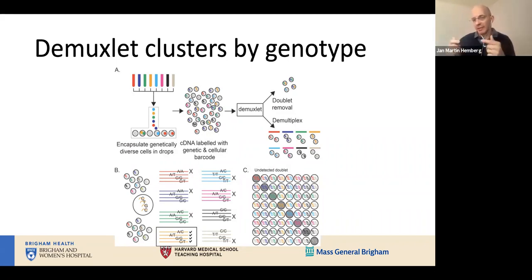You might think that it could be problematic if you have this type of droplet-based data where you only get primarily the 3' or the 5' end of each gene. But it turns out that the authors did some analysis, and they were able to show that if you have, say, 64 donors, you only need about 50 informative SNPs in order to demultiplex the cells with high accuracy. So this is indeed well suited for these types of technologies.